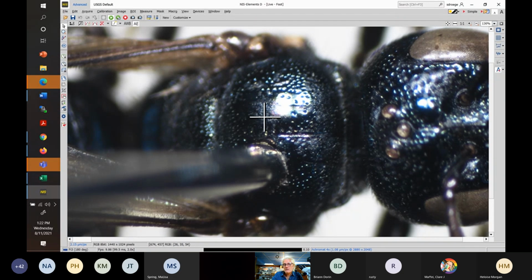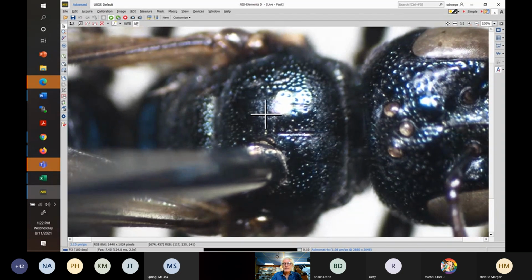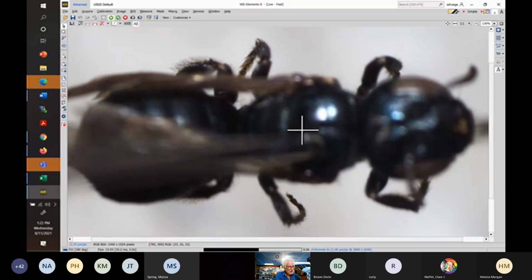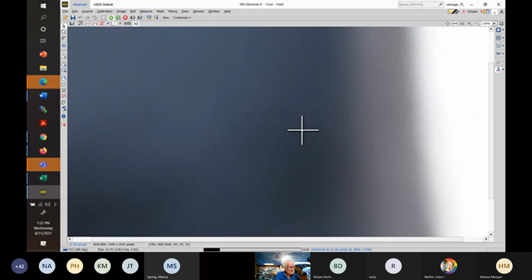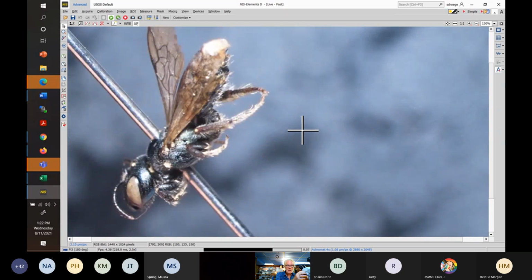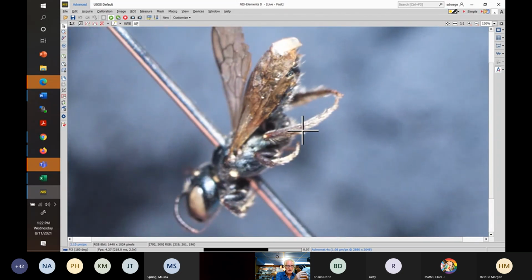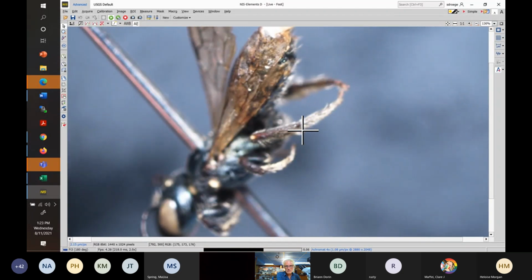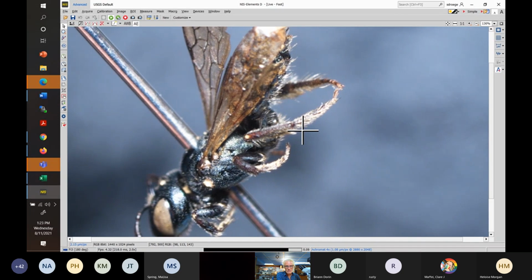So that puts it into the pocket of Ceratina micmaci or Ceratina calcarata, as in this case. But sometimes you are also stuck with, okay, I'm still not 100% sure. Now, a good character, but one that takes a little practice to see, and this is why you would want your own reference collection in lots of cases, is the white hairs, which generally are white, but sometimes in the other species have a slight amber to orangish tinge under the tergites.